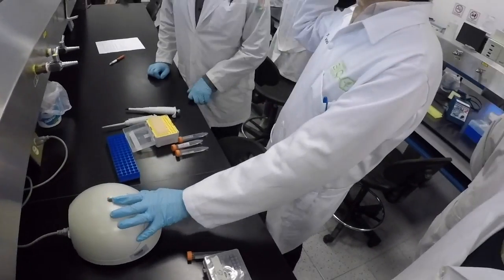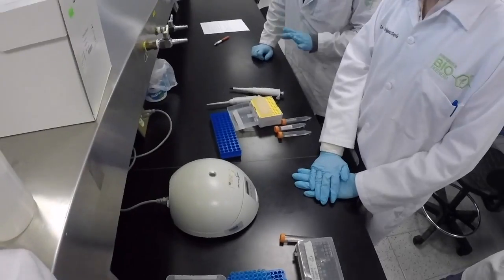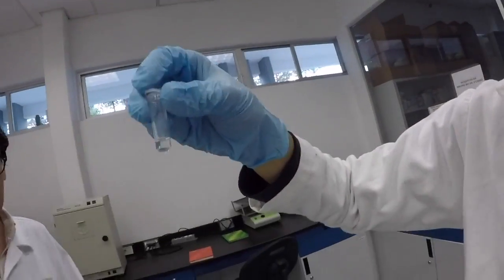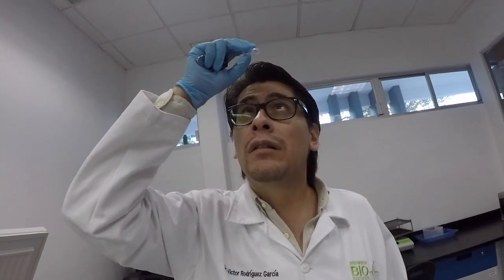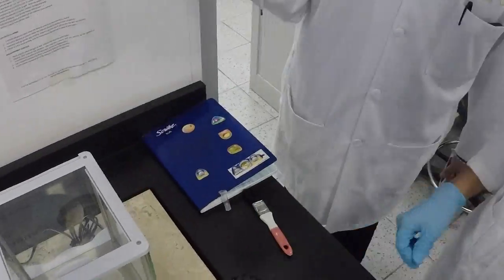Then, the last centrifugation of the day took place at the same 4 degrees for 5 minutes and at a different speed of 8700 RPM. Extra liquid was poured off the tube, and after checking the presence of the DNA pellet, the tube was put into the freezer.